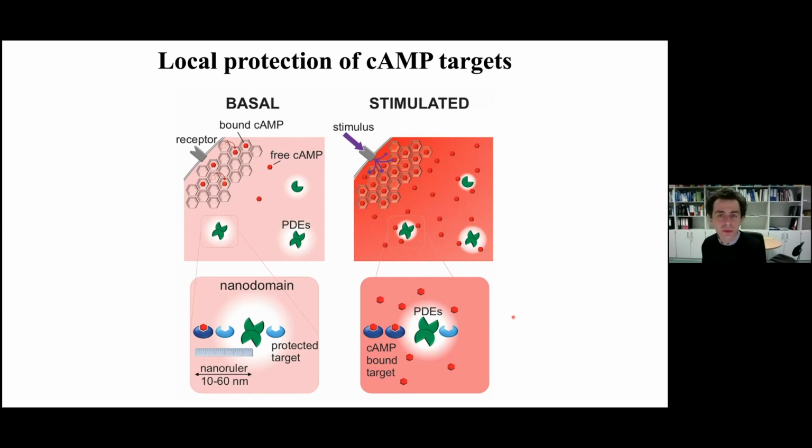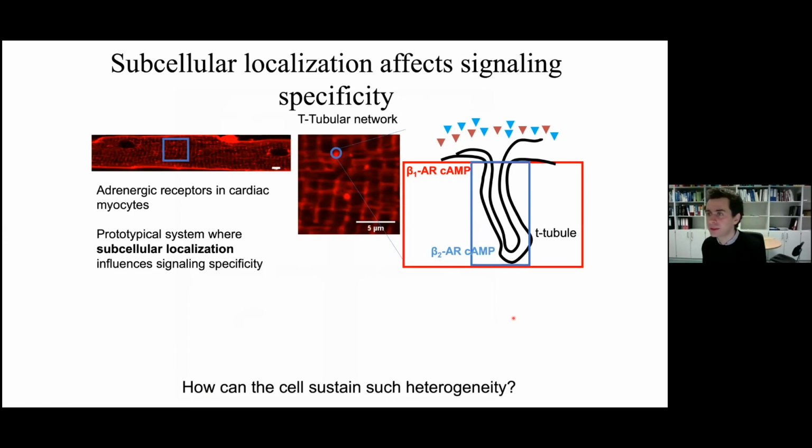So just to stick to the promise I gave in the abstract, I will just show 2 slides of 2 other applications. You're free to ask me at the end, or to contact me later if this has caught your attention. So of course you can use fluorescence microscopy to do way more things. You can look at different types of cells. You see a heart cell here. And you can look at signal which comes from individual substructures. This is interesting because people have postulated that depending on where you stimulate the cells, you can have basically different cyclic AMP waves. And so this is an example where you can use microscopy to actually monitor this.